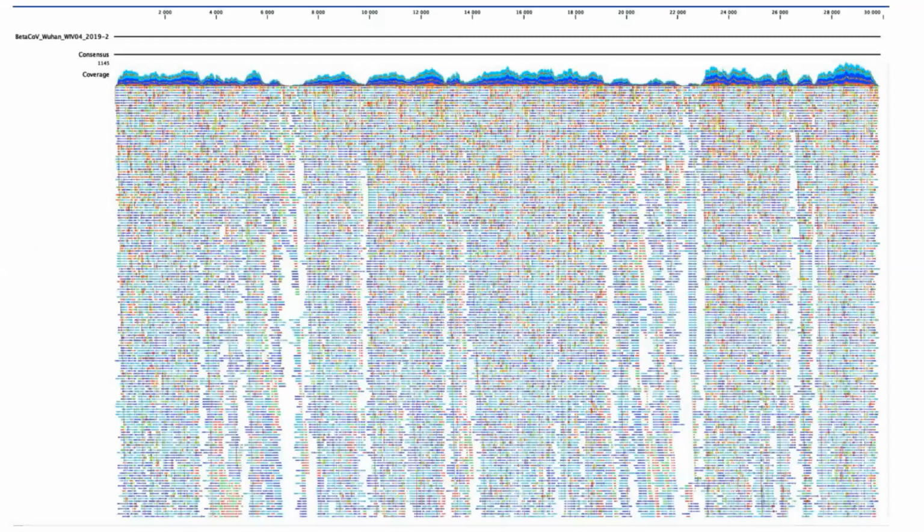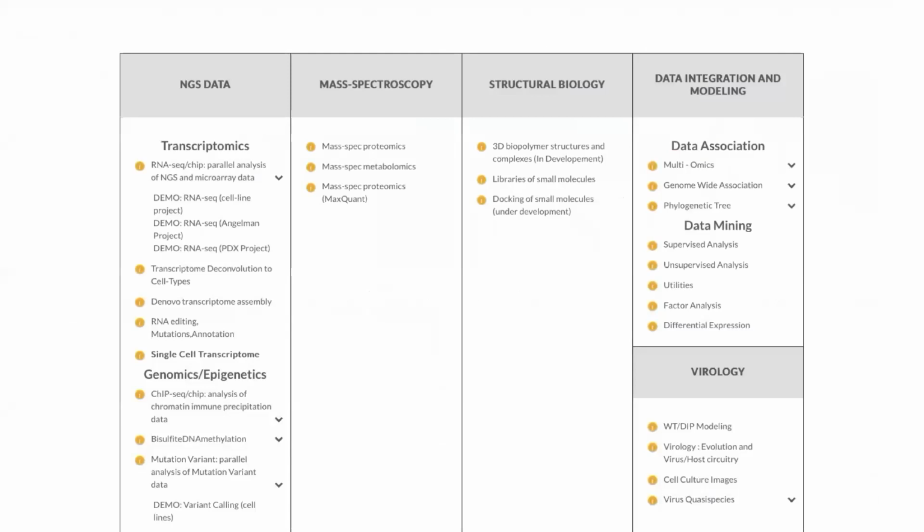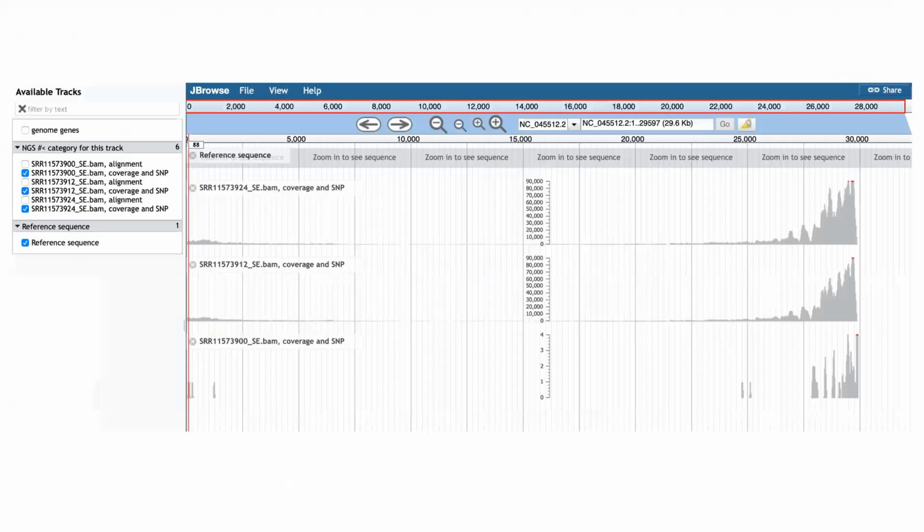We did that to really understand how next-generation sequencing short reads, as you can see right here, can then be translated into actual full genomes. And these are the genomes that we're going to be looking at today on NCBI virus. We talked about a number of different pipelines, for example, visualization of mapped reads. And specifically, we talked about visualizing those reads taken from host genome.